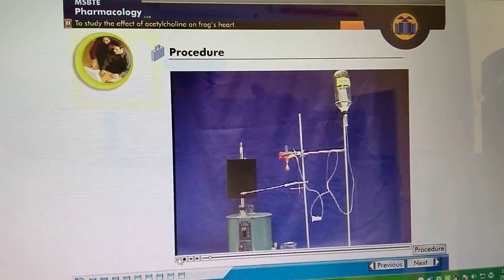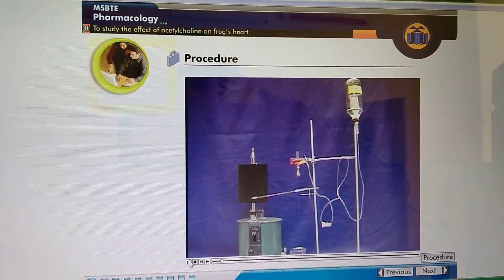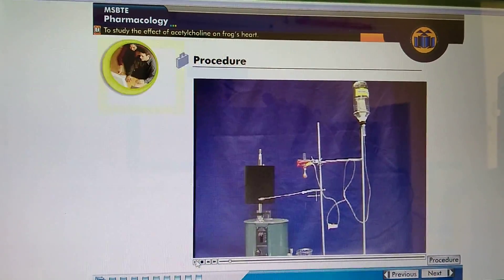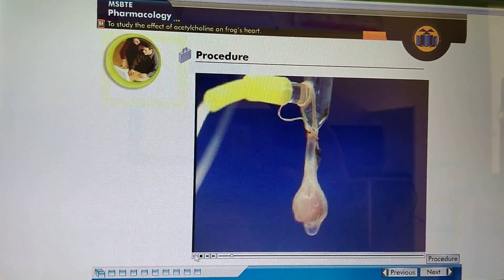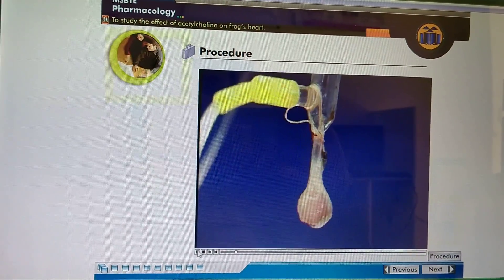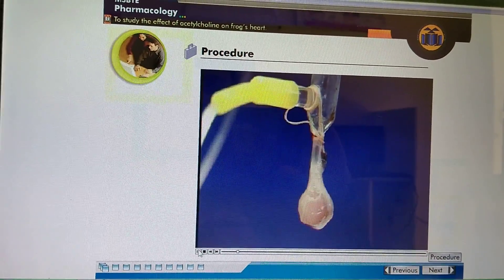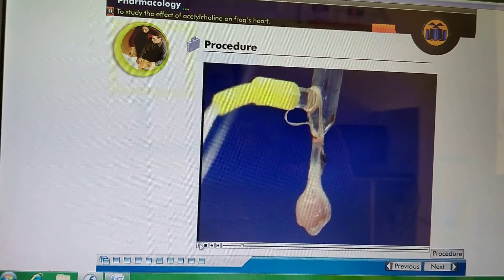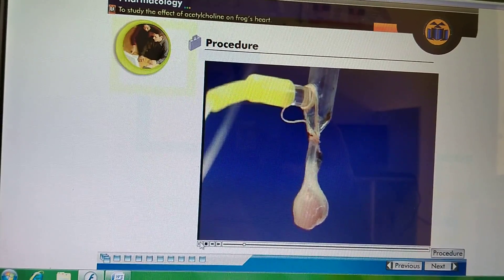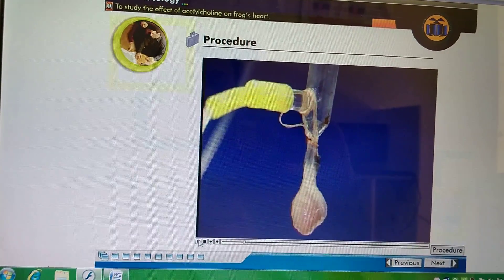To study the effect of acetylcholine on frog's heart, perfuse the heart with frog Ringer solution.